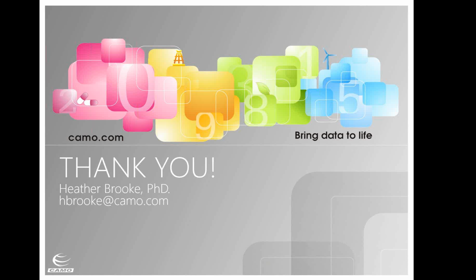I have someone asking that they had a prediction set and got negative values. What could be the reason? It could be that you applied your pre-processing twice. That has happened a lot to me, before I realized how The Unscrambler works and applies that pre-processing. It could be that your data is different for some reason, if you have some offsets in your wavelength ranges. It's hard to know without actually looking at your data.